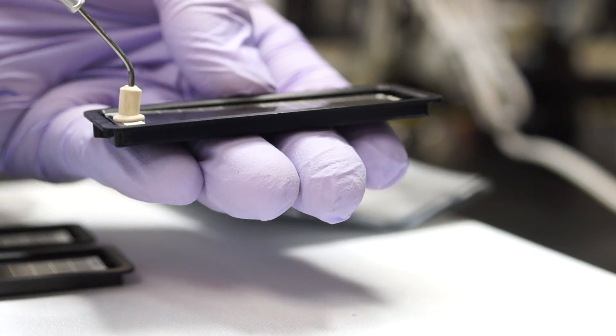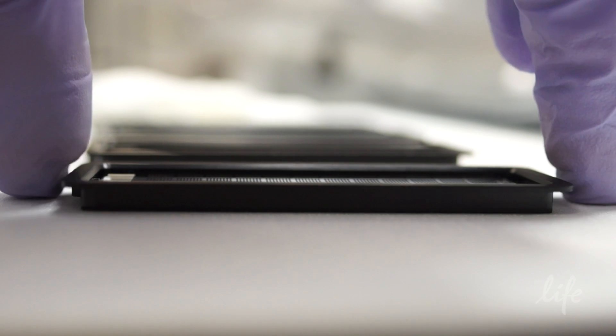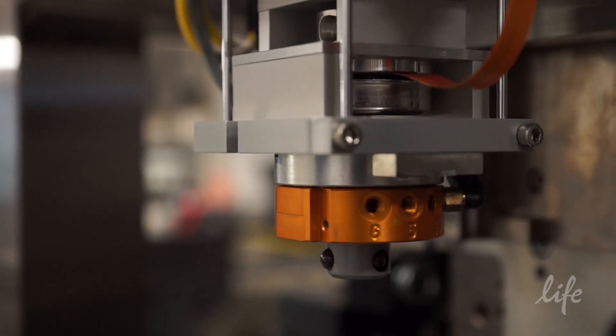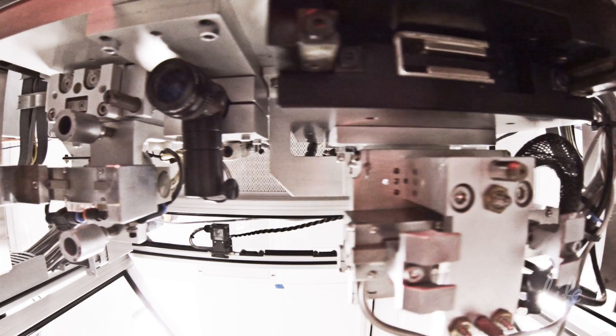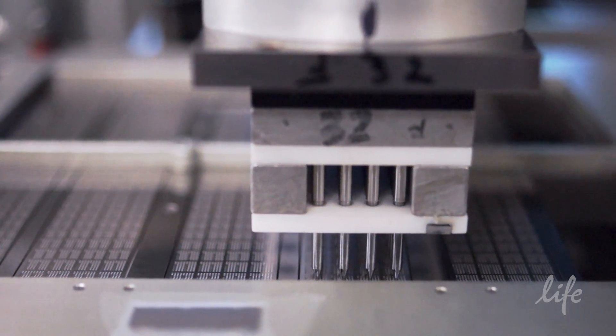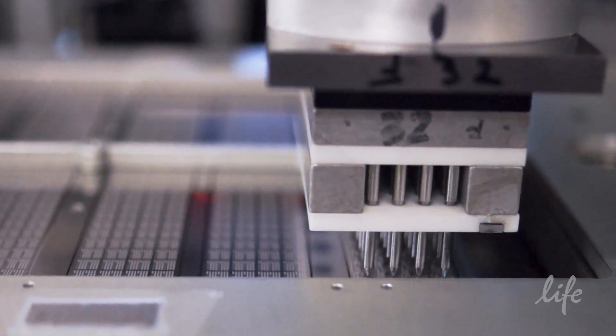The open array plate has been specially designed to have over 3,000 low volume reaction wells. Each 33 nanoliter well ensures that very little reagent is used in generating a data point. In addition, the plate can be partitioned into a variety of different formats, so that varying numbers of TACMAN assays and samples can be loaded onto the plate for specific applications.